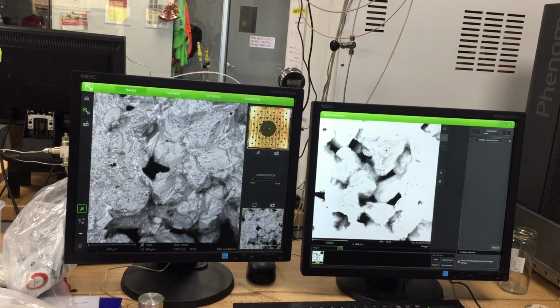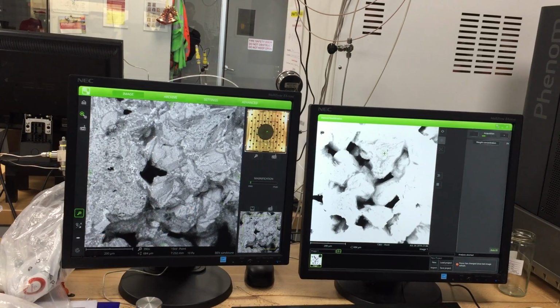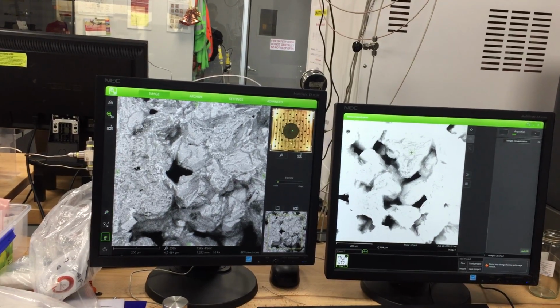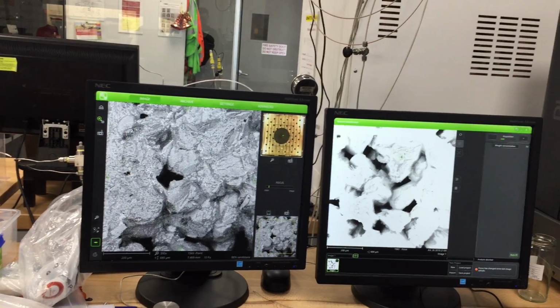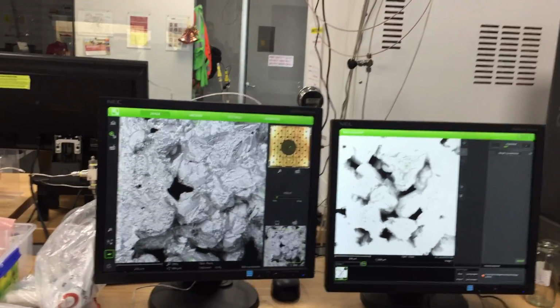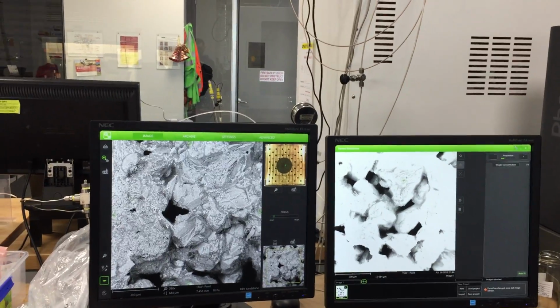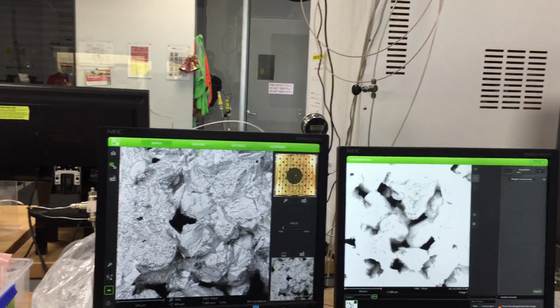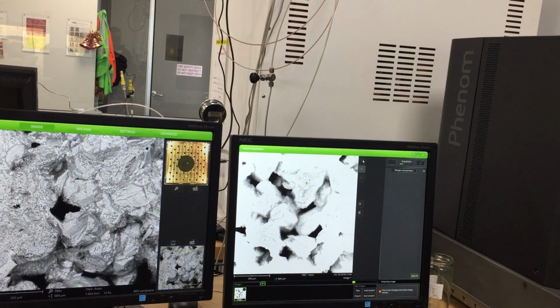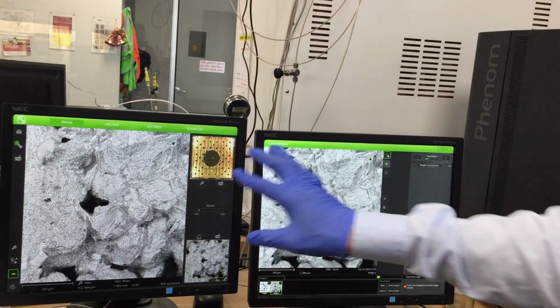Look, just show us the Elemental. For now, right? So I'm going to focus slightly because we reduced the height down, right? Okay. Looks better, right? Yeah, because the distance is further away. So now we focus it, and then we come here and click it again, and the image looks better.